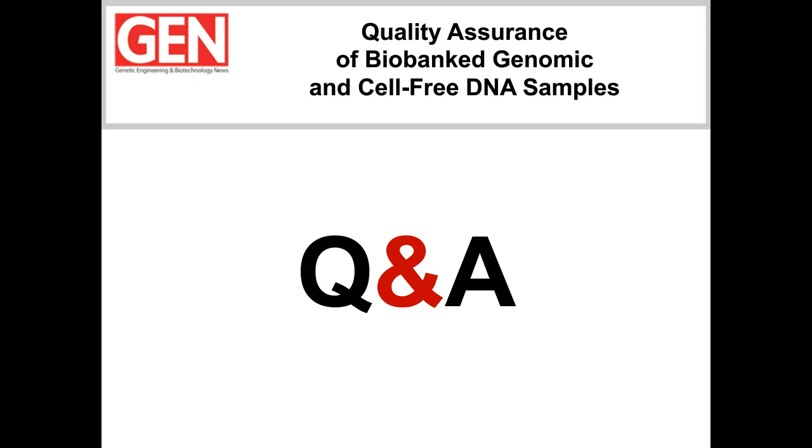And yes, we have seen a significant difference in terms of DIN between the controlled and the uncontrolled FFPE blocks. So, yeah, that's the answer I could give to this question. Great. Thanks, Faye.